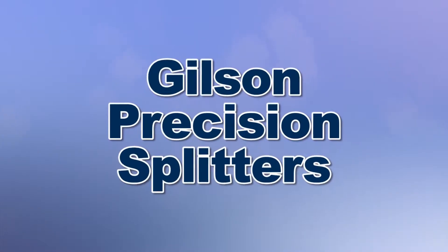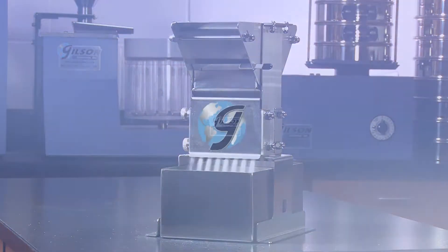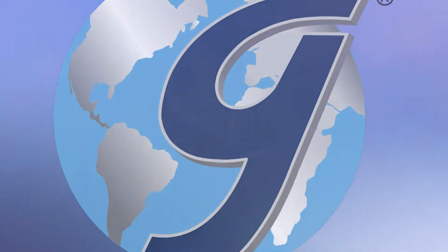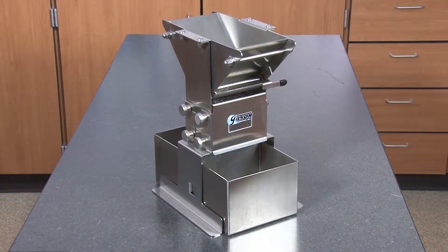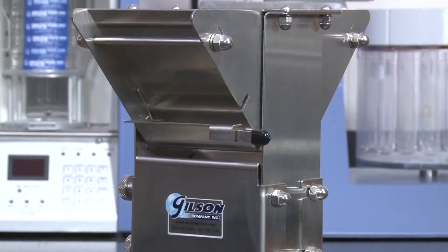For best results in material testing, accurate, representative sampling is essential. Let's take a look at some of the exclusive features of the rugged Gilson Precision Splitters, used to divide bulk samples of fine granular materials and powders.